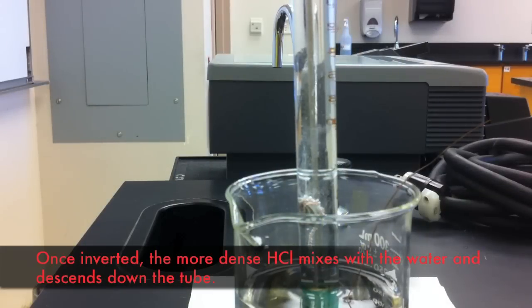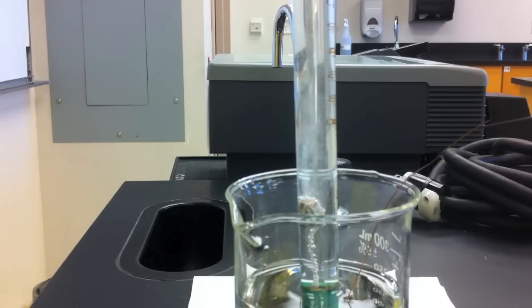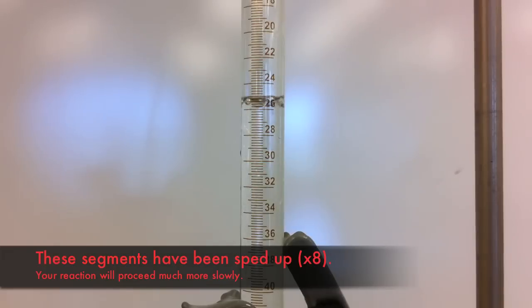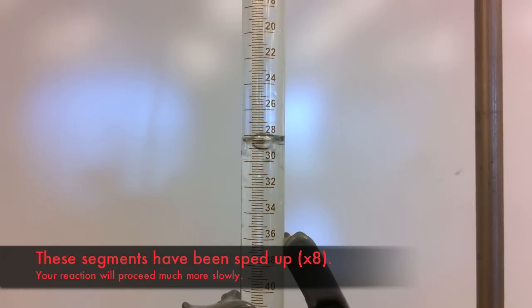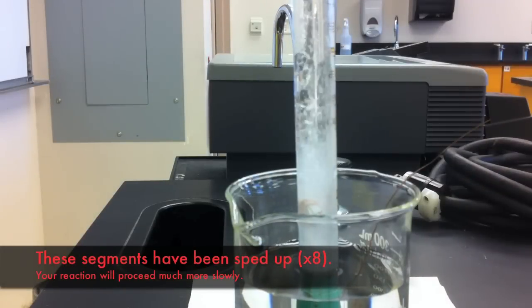Once the burette has been inverted, the more dense hydrochloric acid will begin to mix with the water and travel down towards the magnesium ribbon where it will undergo a reaction. This reaction produces hydrogen gas that you can see bubbling from the ribbon. As the hydrogen gas is produced, it bubbles towards the top of the burette tube. This pressure forces the water out of the tube, lowering the volume of water in it. You will notice that the volume of water in your beaker increases as the reaction proceeds.